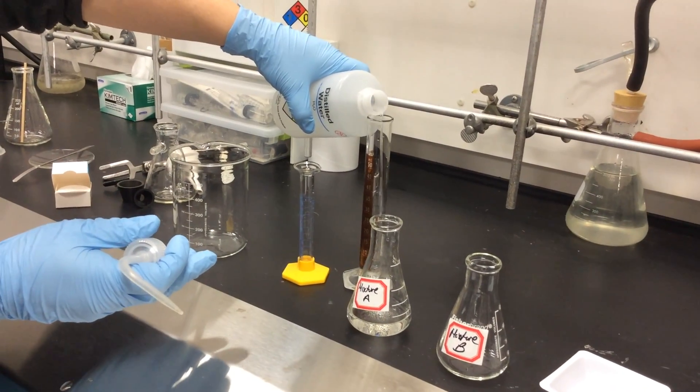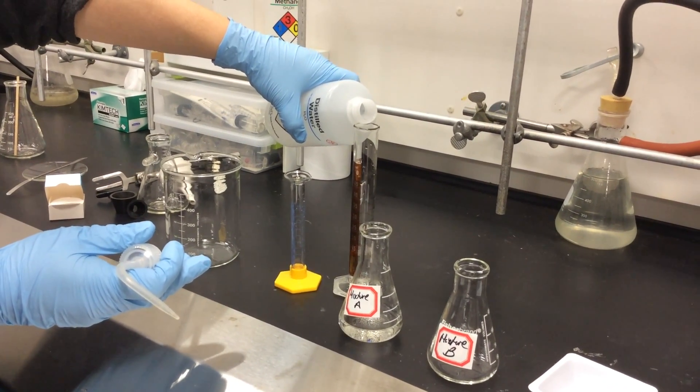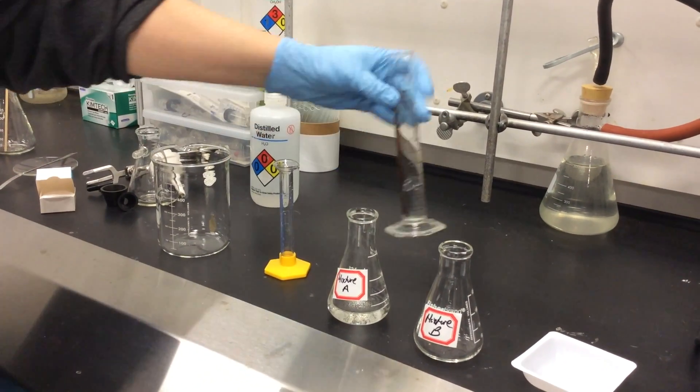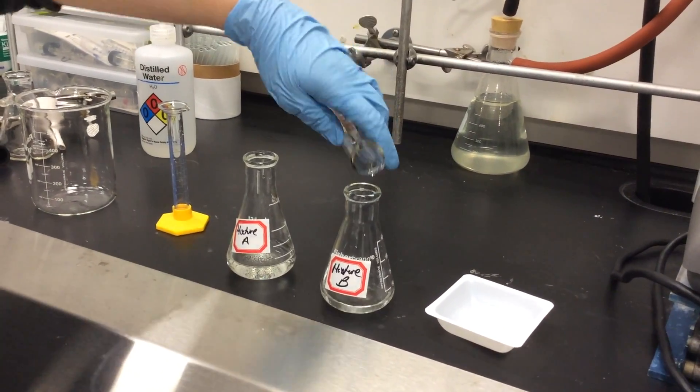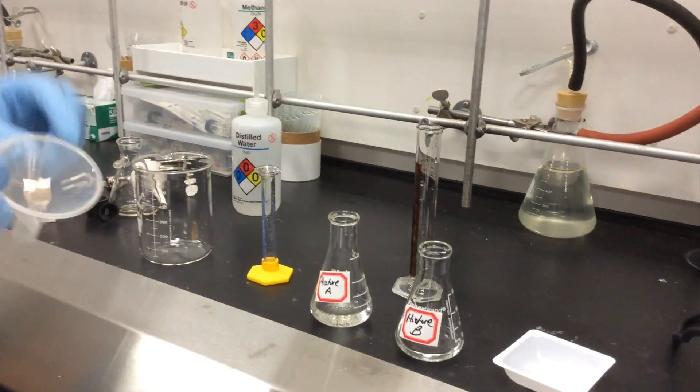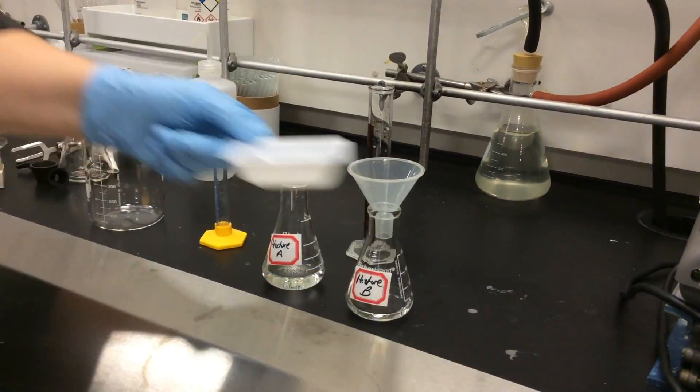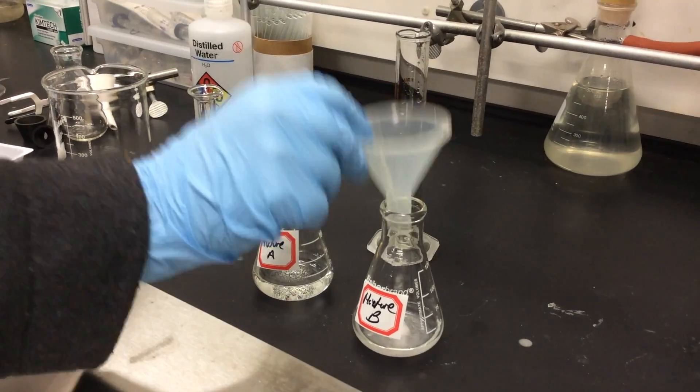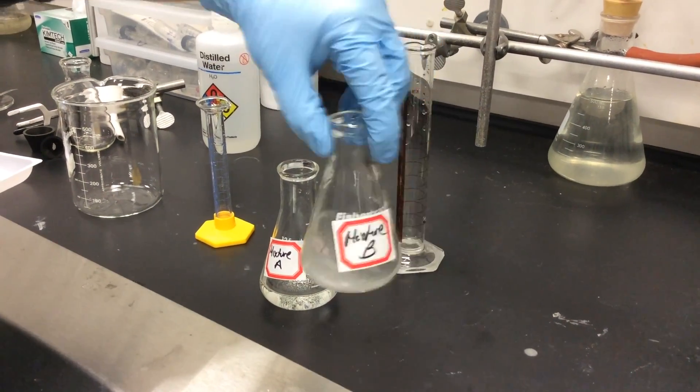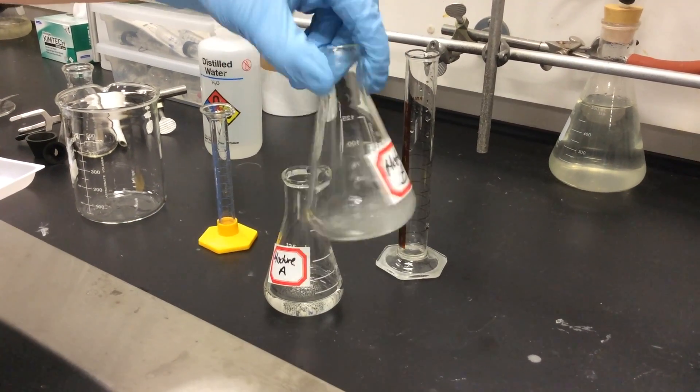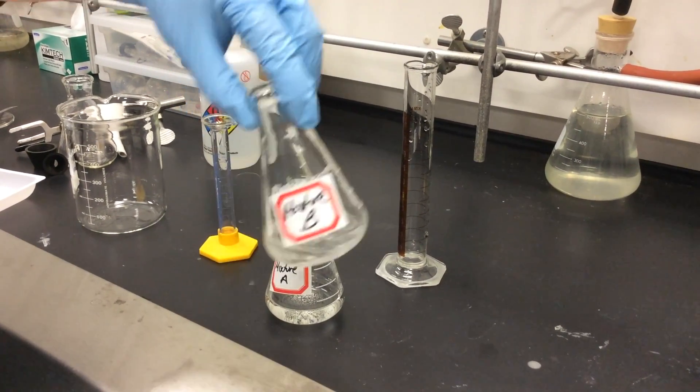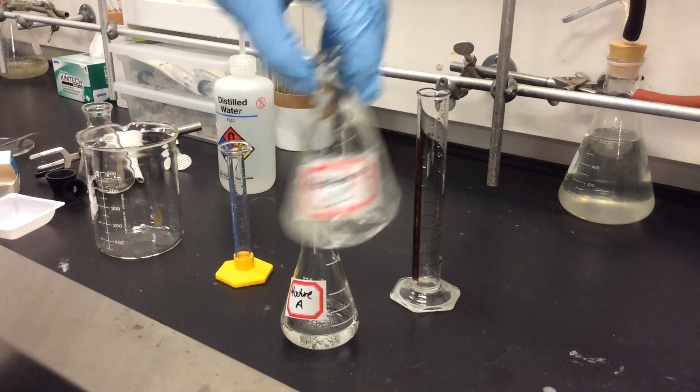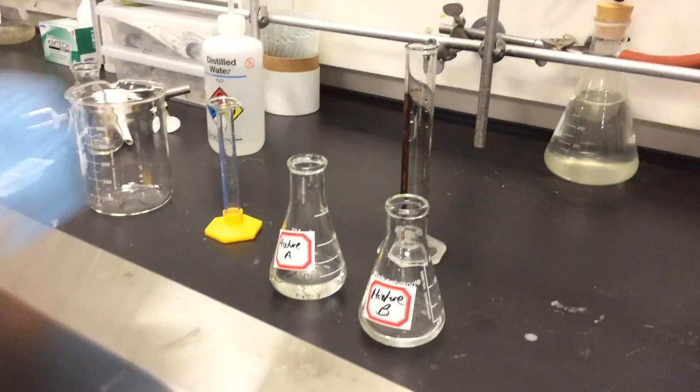Now we're going to put 15 milliliters of water into our graduated cylinder, pour that into the mixture B flask. Now we're going to get our powder funnel, which is a funnel we can use to put our 2.4 grams of anhydrous sodium acetate into our flask. Water and the acetate we will mix together. Once that is mixed and all the sodium acetate has been dissolved, you can do this just by vigorously shaking it like you see here.